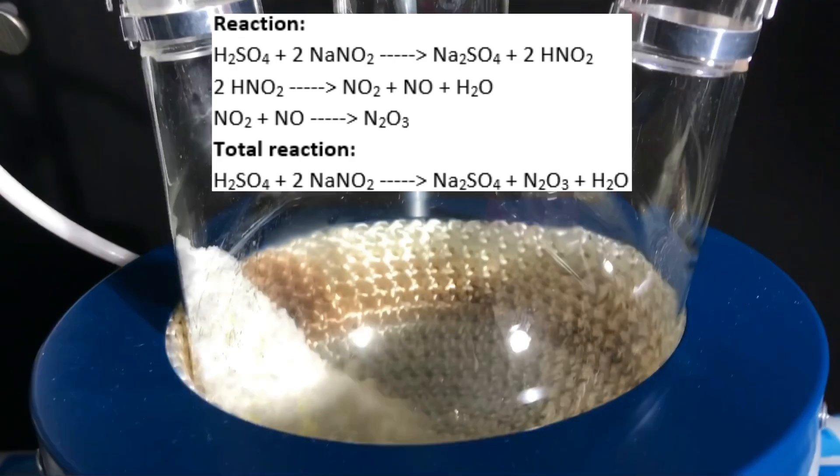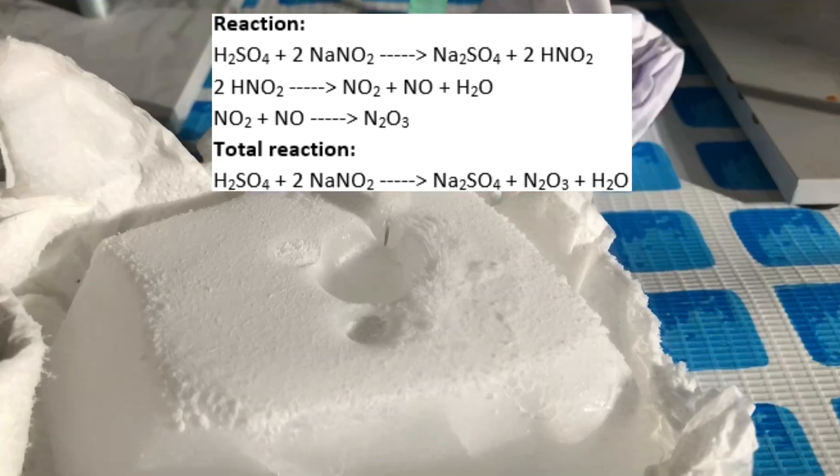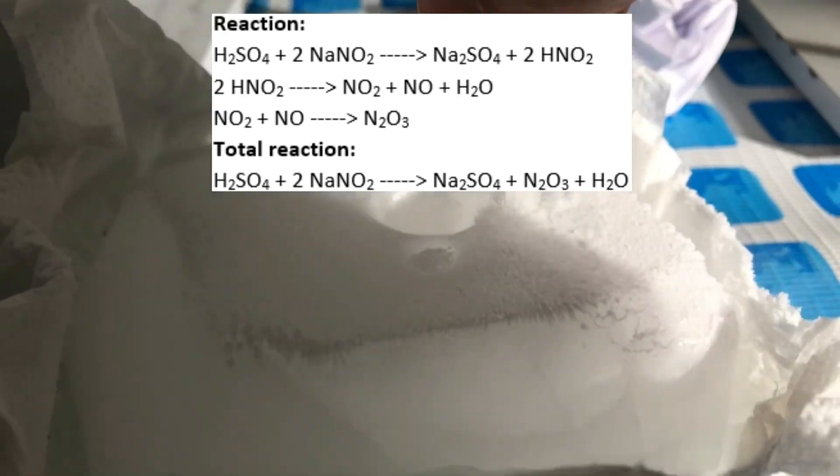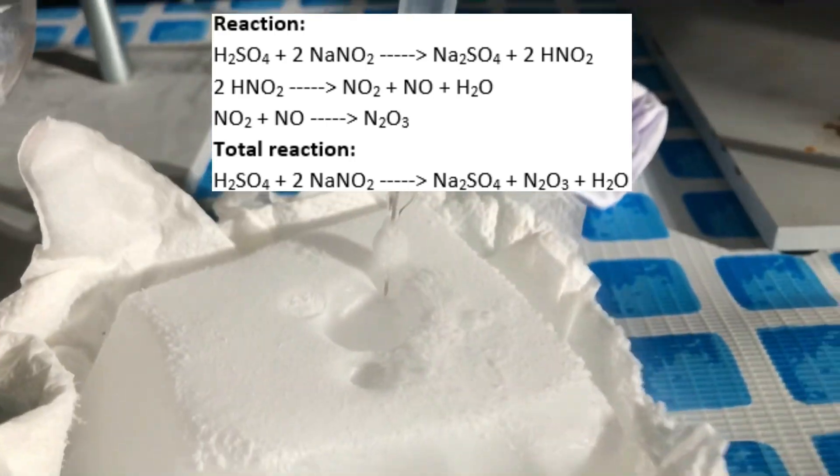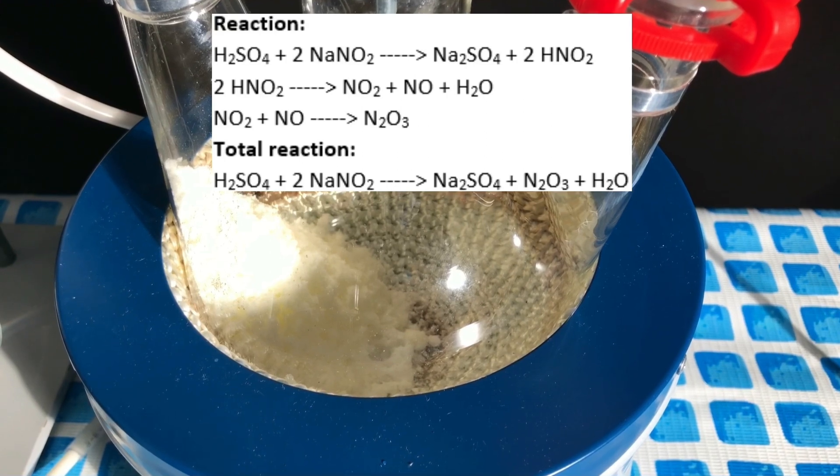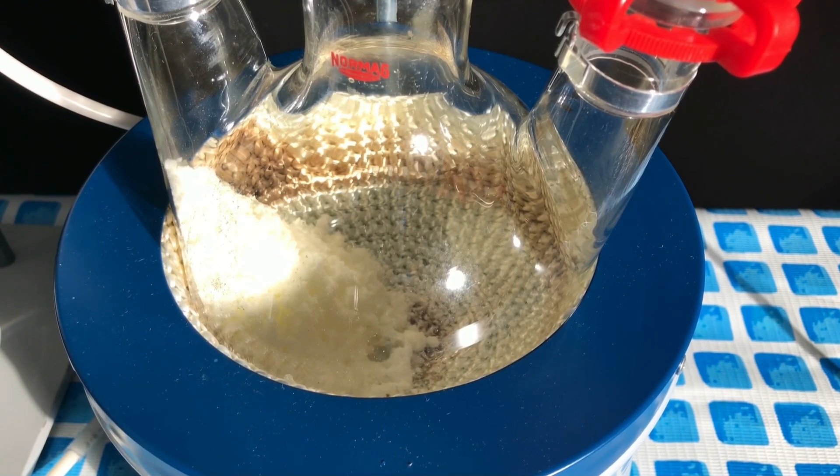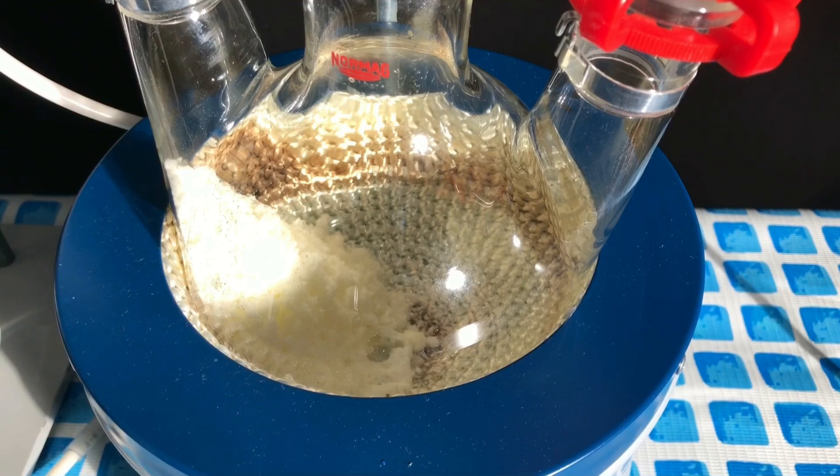Sulfuric acid first reacts with sodium nitrite to form sodium sulfate and nitrous acid. Most of the nitrous acid then decomposes to form equimolar amounts of nitrogen dioxide and nitrogen monoxide. These can later be condensed to form dinitrogen trioxide. With leftover oxygen, some of the nitrogen monoxide would react with oxygen to form nitrogen dioxide. This would completely destroy the purity of our product.